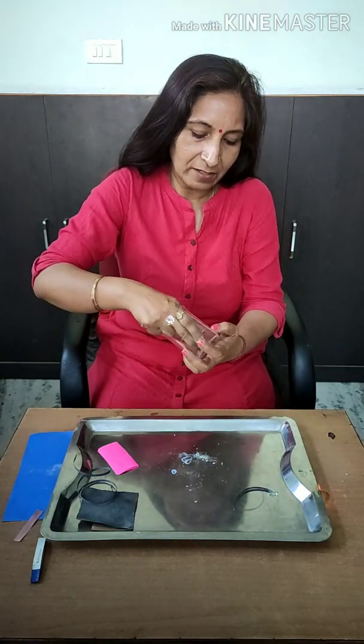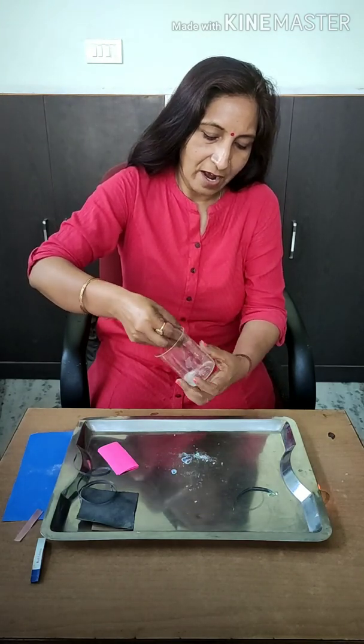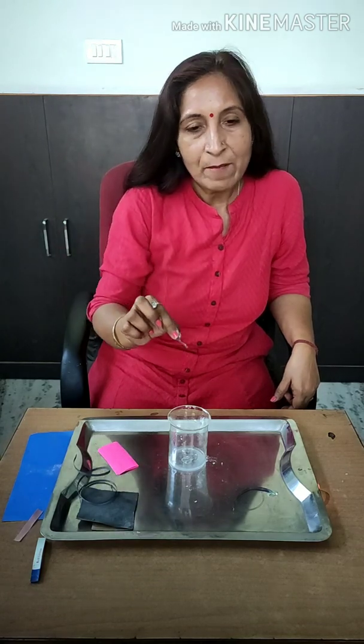So let us see whether the color has changed — and yes, it has changed. I am showing you the color of this litmus paper — see, it is now blue. So it proves that magnesium oxide, which is a metallic oxide, is basic in nature.